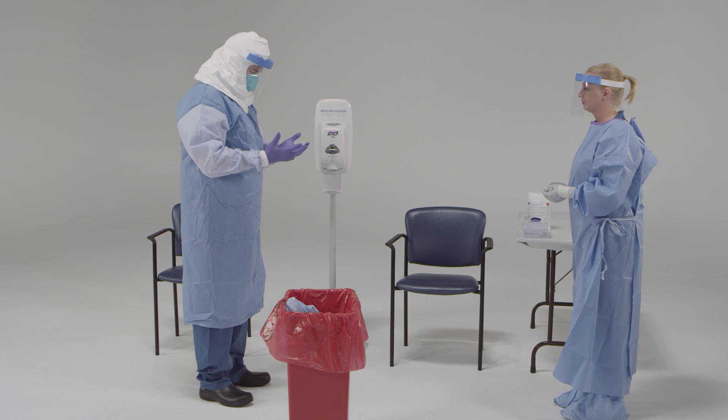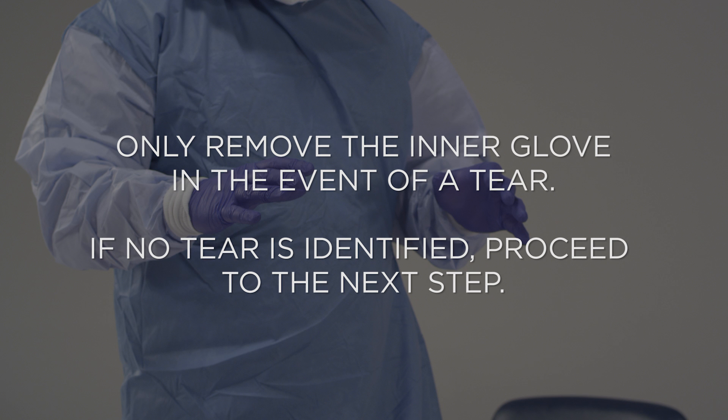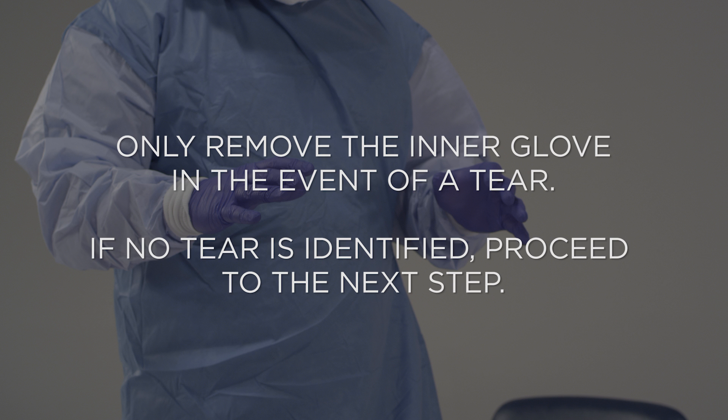Good job. Now, inspect both sides of your inner gloves for visible tears or contamination. If you do see a tear, hole, or signs of contamination of the inner gloves, disinfect with EPA-registered disinfectant wipes or alcohol-based hand rub. Then remove the inner gloves, making sure not to contaminate your bare hands. Once the gloves are off, perform hand hygiene with alcohol-based hand rub on your hands. Then put on a new set of gloves up to the edge of the sleeve. Now, disinfect your gloves.